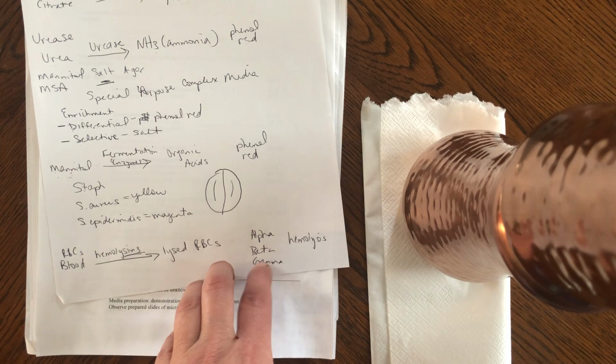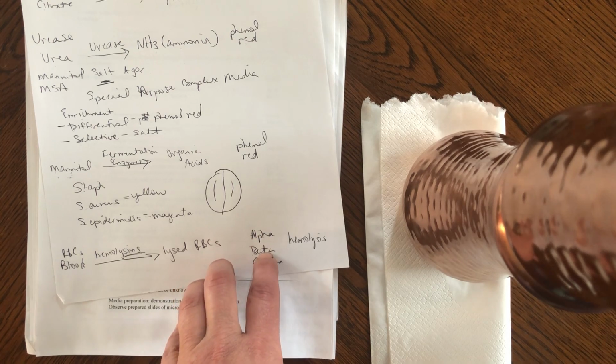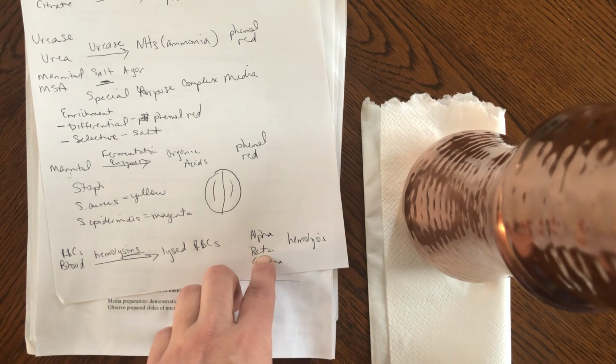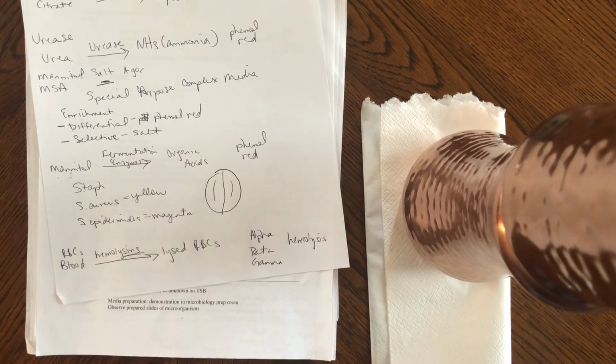I don't think I've ever had a class where we see anyone with gamma hemolysis on their plates, but often we see alpha, mostly alpha, in people's throats, and beta hemolysis in people's throats. So this year, when I was sick earlier in the semester, I was pretty sure I didn't have strep throat, but I was getting those white spots in my throat. I had one plate of blood agar left from the previous semester, and I swabbed my throat to see if I was going to get this beta hemolysis. If I did, I was pretty sure I had strep throat and I was going to go to the doctor. But my throat swab was alpha hemolytic like it always is, so I didn't worry about it being strep throat. I knew it was probably some other kind of infection.